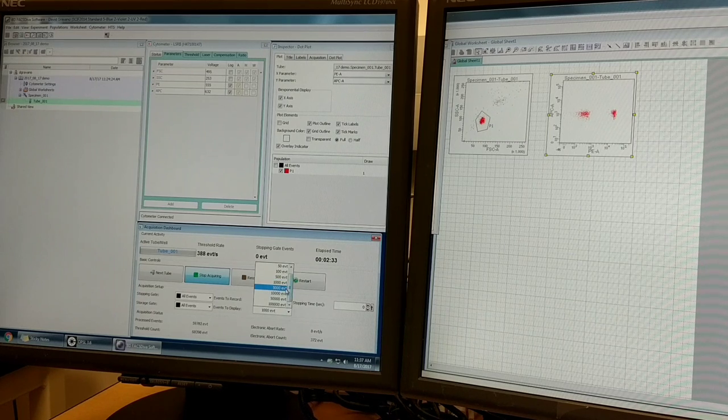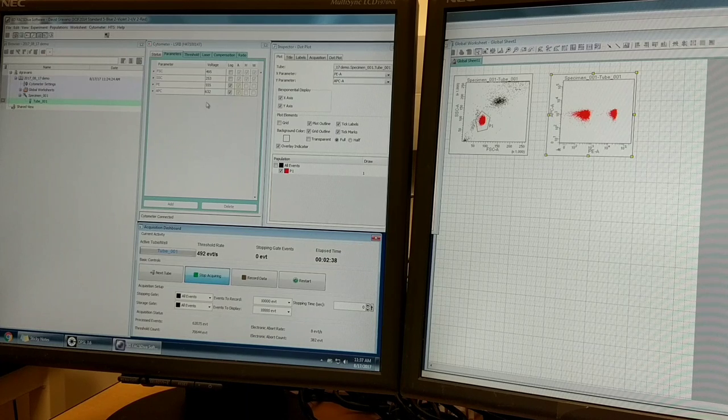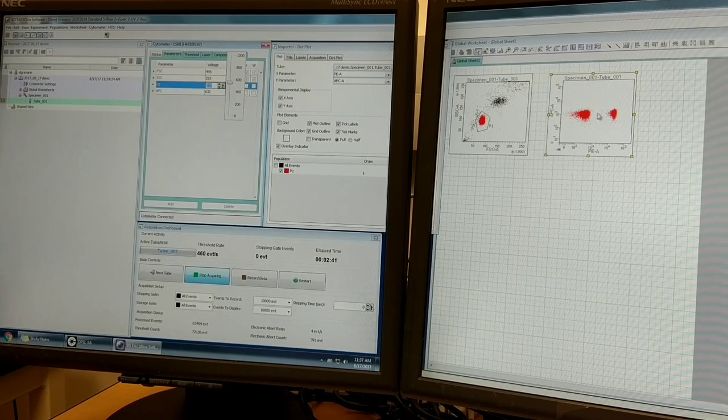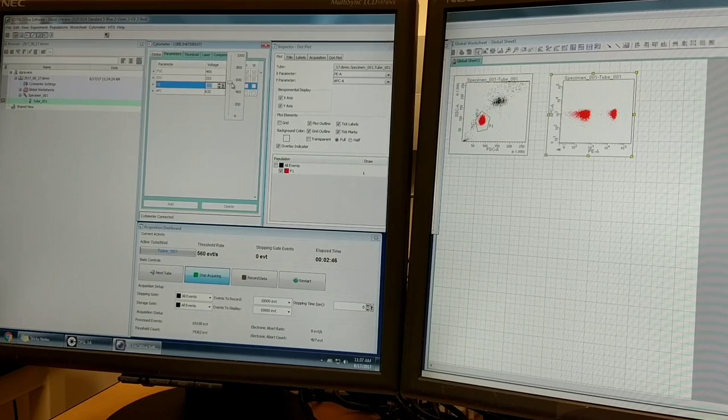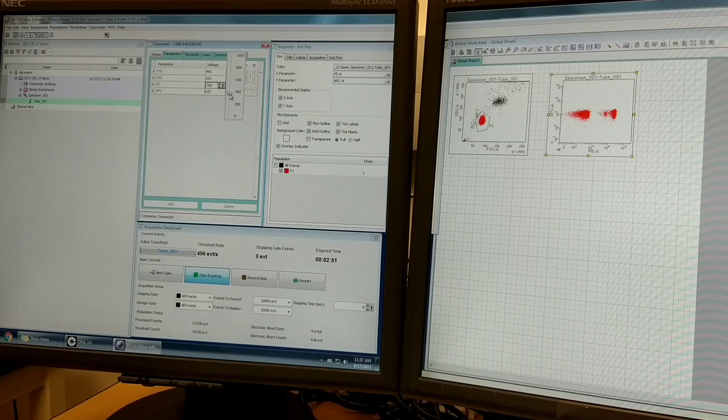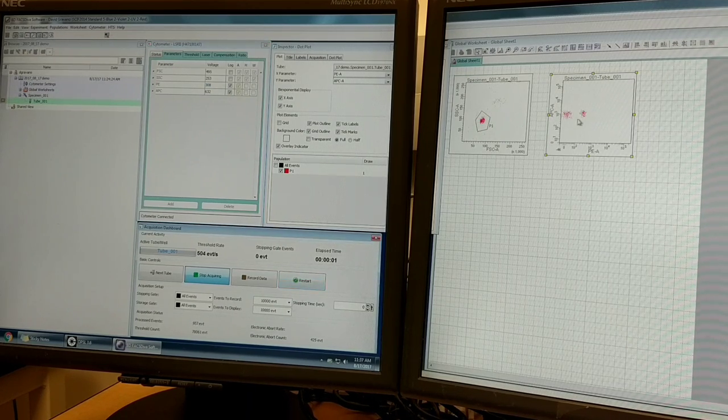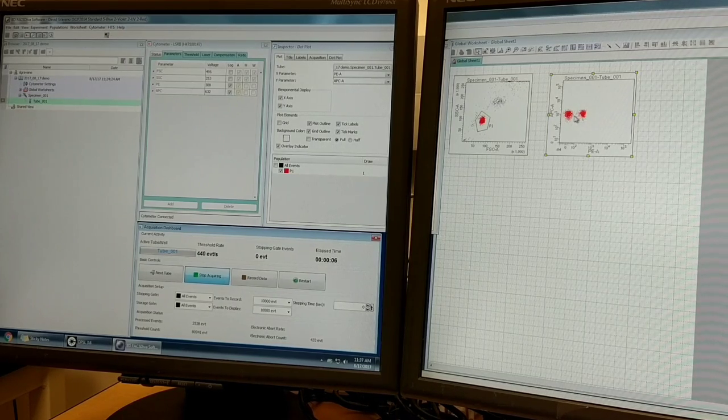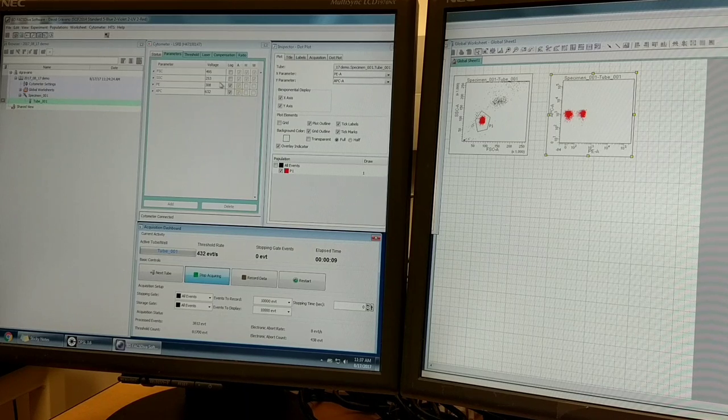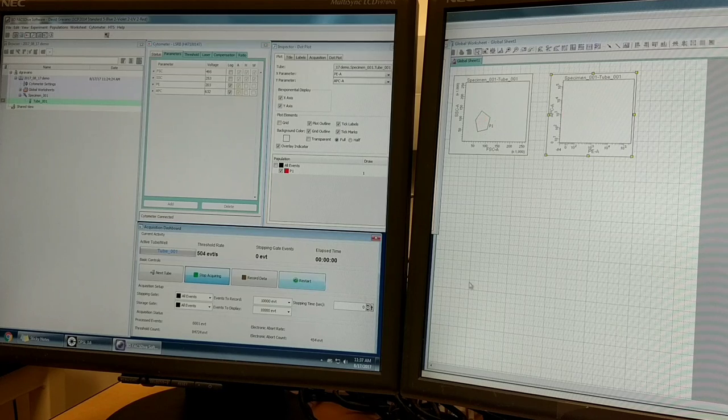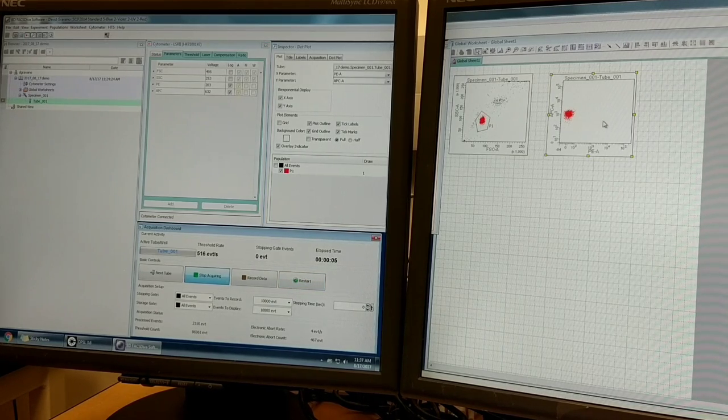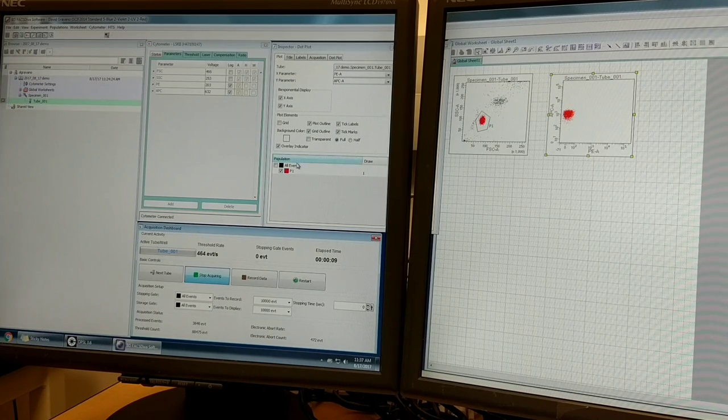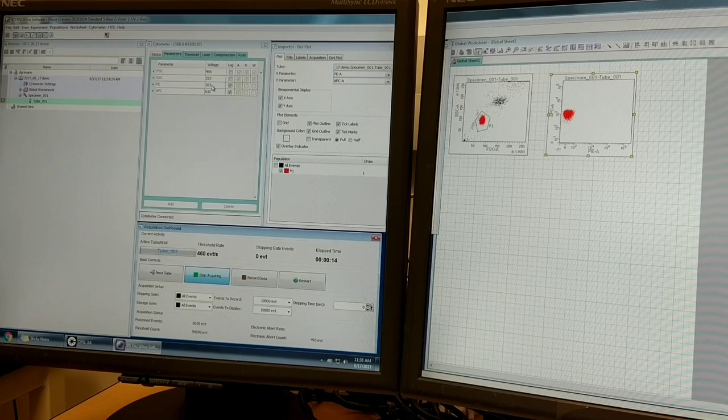Now what I want to do is adjust this PE voltage where the difference between these two is the greatest and I have reasonably low background. Let me show you an example of a setting that's too low. Let's say I set this to 300. Now you can see the background is extremely low, but the positive is not extremely positive and there's not great separation. Let me go to an even further extreme - let's set this to 200. You're going to see now that there is no separation of PE. Even though there are PE-labeled beads in here, you can't see any difference between unstained and PE-labeled beads. This would be an extremely bad situation.